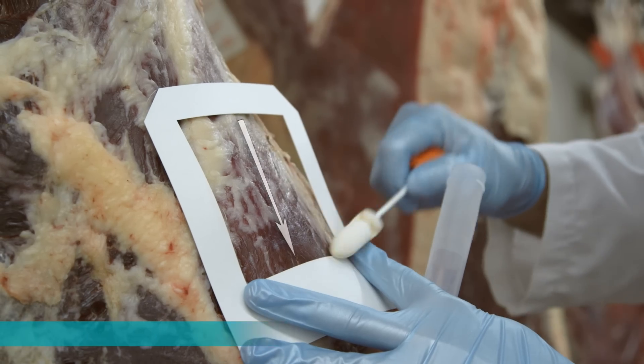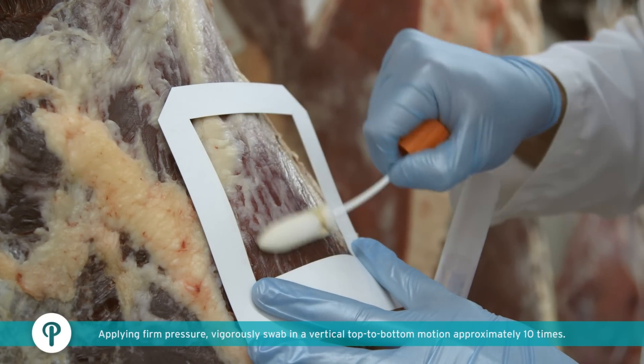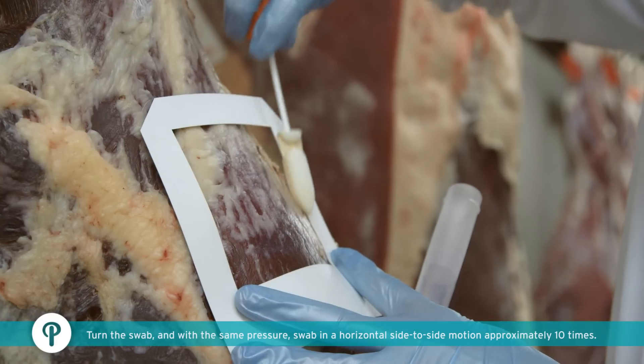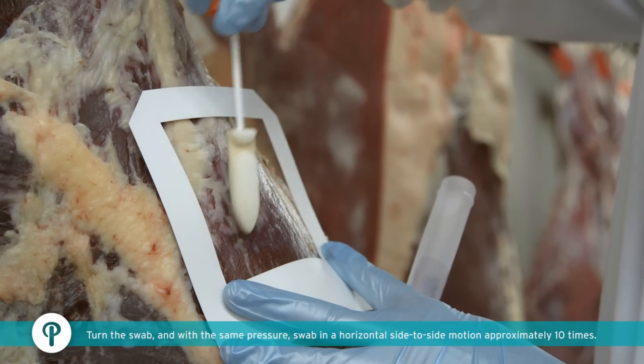Collect a sample within the sampling template by rubbing the swab in a downward motion with firm pressure approximately 10 times. Turn swab to opposite side and collect the sample within the sampling template with firm pressure in a horizontal side-to-side motion.